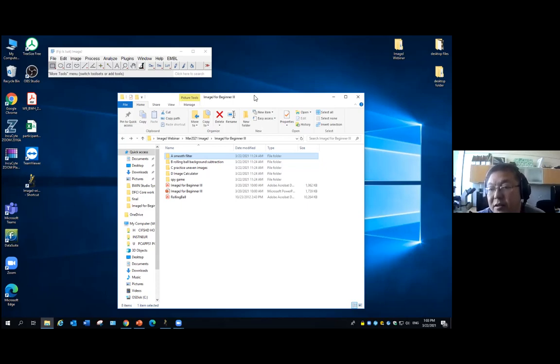Once you can achieve such a nice mask image, we can use a function that is probably one of the most used functions in ImageJ, especially if you're doing cell counting. That would be Analyze Particles. You can use that to automatically get the outline, the ROI, for all the white objects in the field of view. Inside that function, you have a lot of parameters you can choose, to allow you to select only objects with a certain size, a certain shape, whether on the edge or not. Once you have those ROIs in a list, you can apply them to your raw image and do the corresponding measurement.